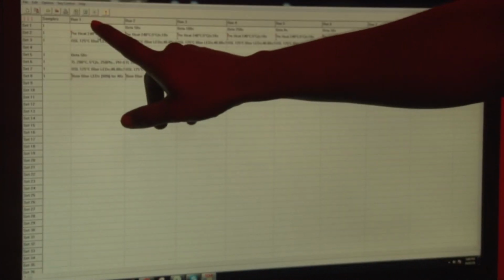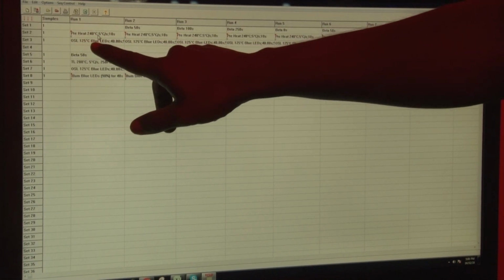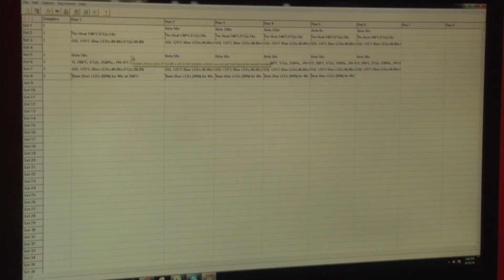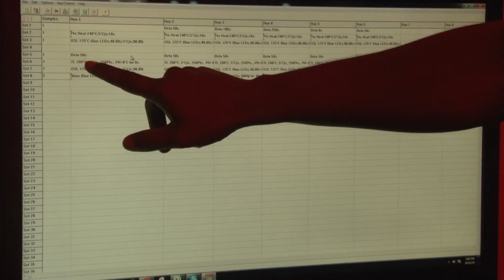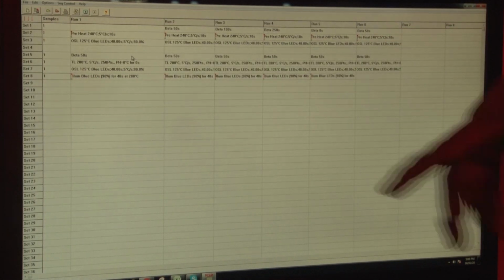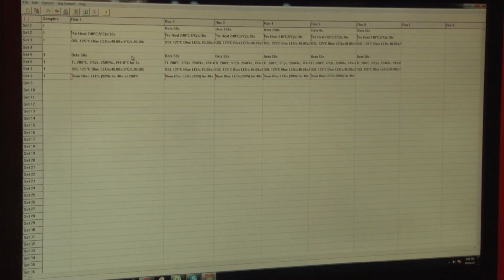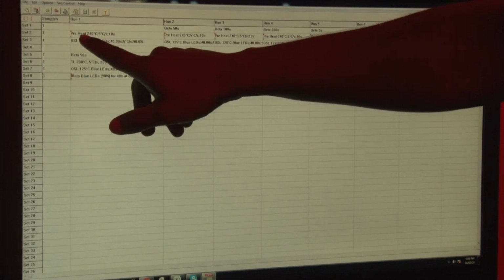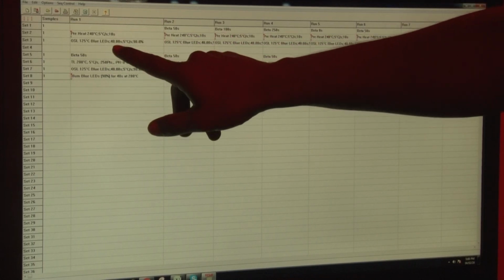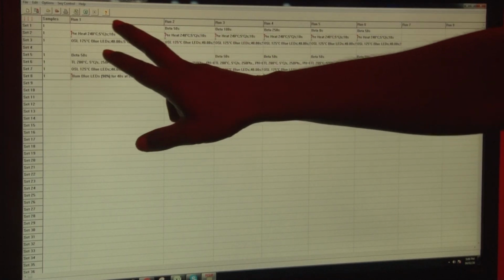Here you can see in run number 1, first it is the preheat, then OSL at 125 degrees for 40 seconds, and then another beta dose for 50 seconds, then TL, then OSL, and then illumination with blue LED. So this is the protocol and the procedure which we are applying to our sample. This portion is empty, because in run number 1 we are estimating the natural radiation, the radiation which has been accumulated in the sample naturally.